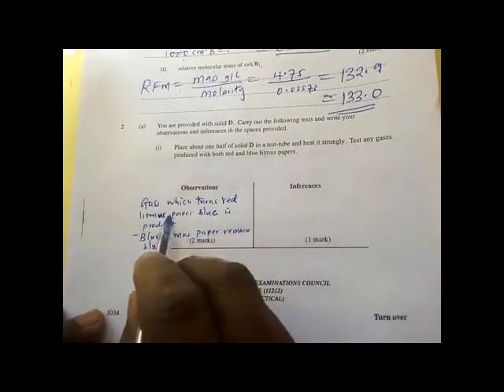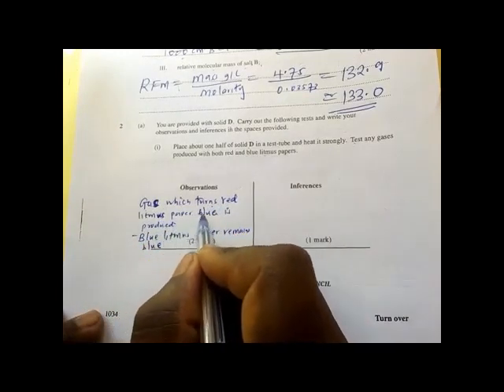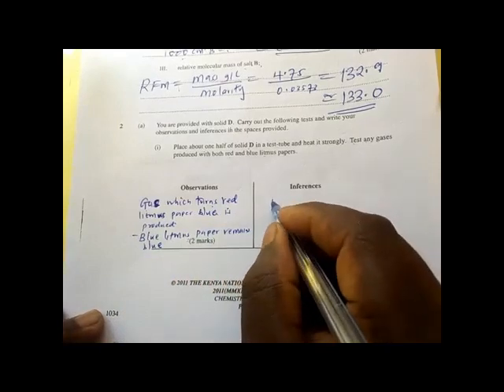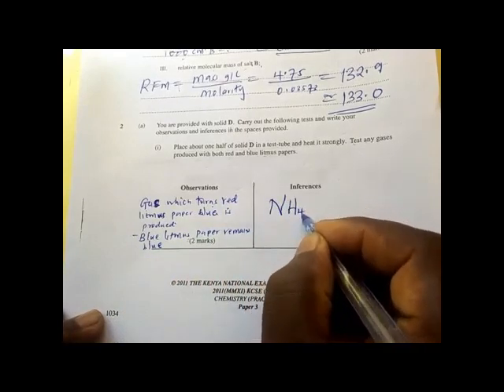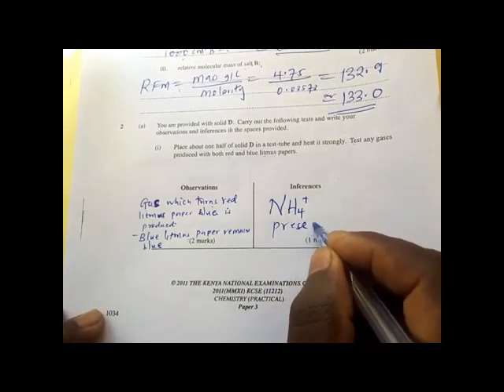Yes, so when a gas is produced which turns red litmus paper to blue, that gas is a basic gas. Therefore, the ammonium ion is present.